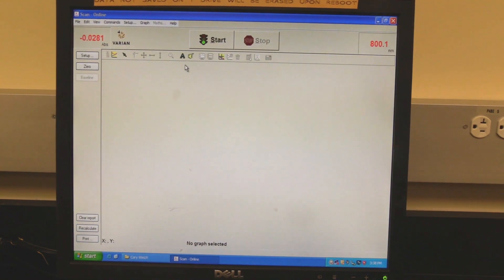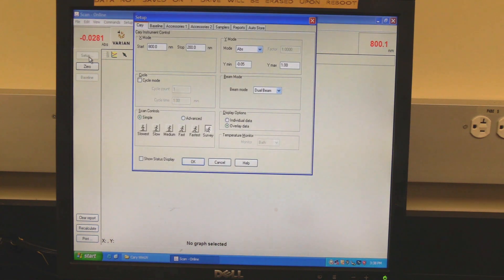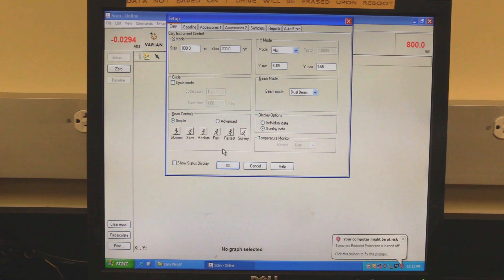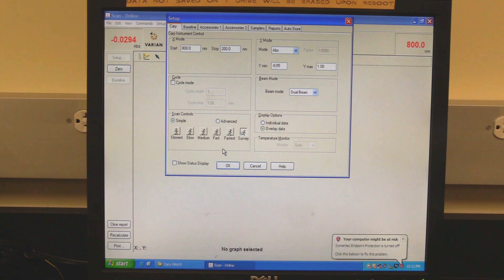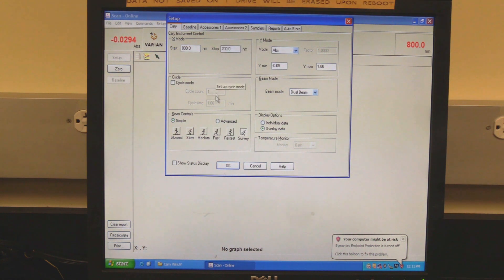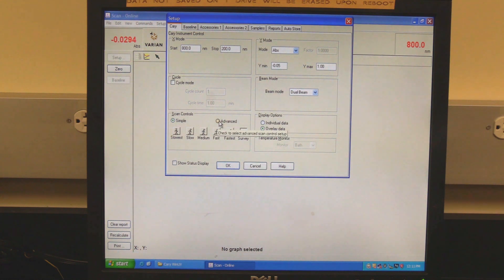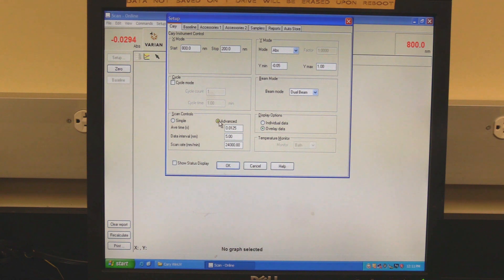Click on Setup to set measurement parameters. Setup should open to the Cary tab. In the X mode section, set the scan range — Start is the higher wavelength, Stop is the lower wavelength. Beam mode should be set to dual beam. In scan controls, set the scan speed. Simple or advanced controls can be selected. If simple is selected, choose one of the speed modes.